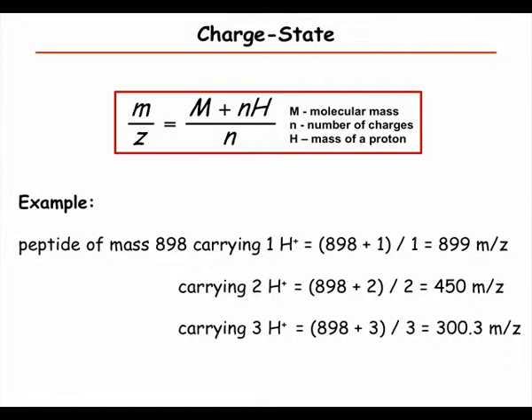And if one, instead of using the proton mass, uses the hydrogen mass, it's not good enough. So one has to use the exact numbers. And I'll give you a list of those numbers so you can have them.